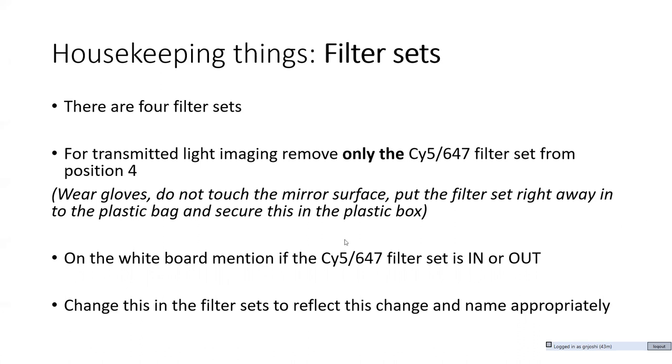Put the filter set right away in one of the plastic bags and secure this plastic bag into the plastic box. So I'll also show this part to you tomorrow in case you need to remove the filter set, how to remove that. Putting the filter set back inside could be a bit tricky, so I don't expect you to put the filter set back in. You can mention that on the whiteboard, which will be on the wall next to the microscope, whether or not the 647 filter set is inside or outside. And I can take care of putting the filter set back in if anybody else needs to use that. Okay.